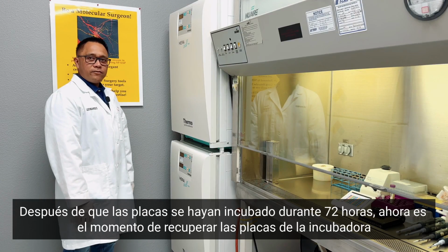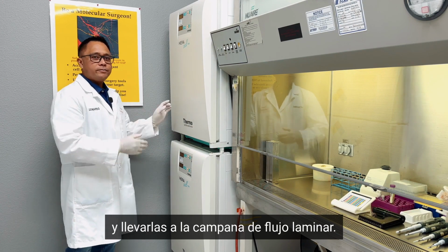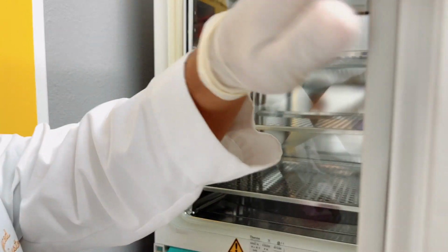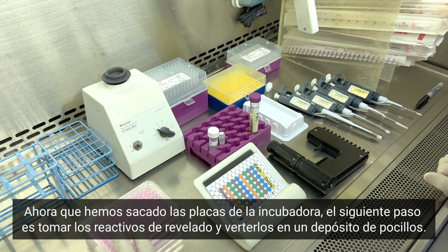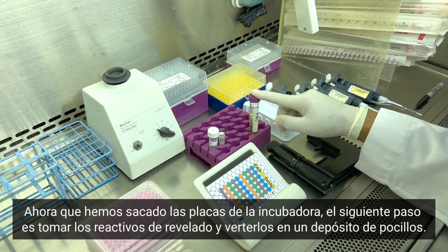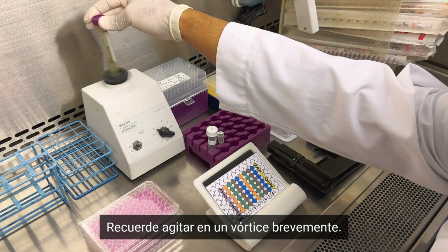So after your plates have been incubated for 72 hours, now it's time to retrieve the plates from the incubator and bring them into the hood. Now that we've retrieved the plates from the incubator, the next step is to take the developing reagents and pour them into a well reservoir. Remember to vortex briefly.